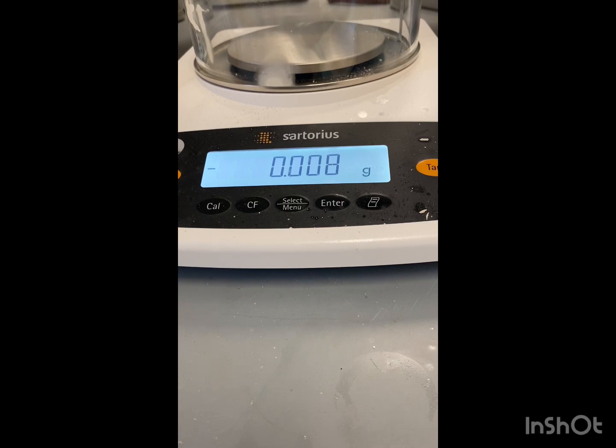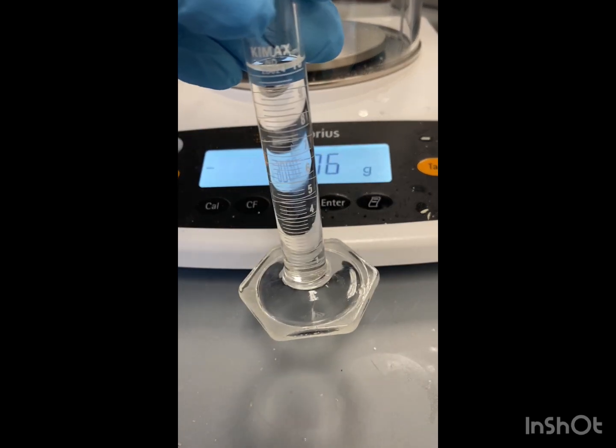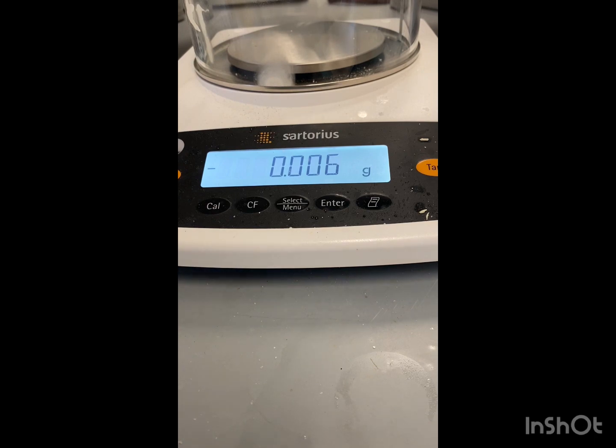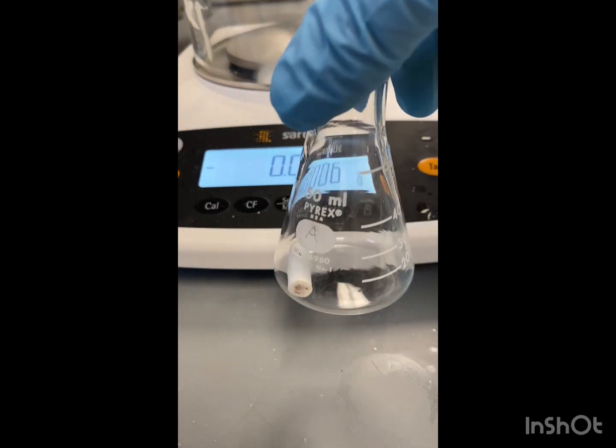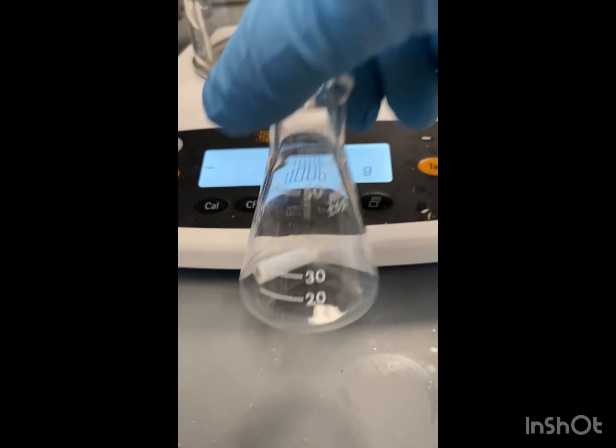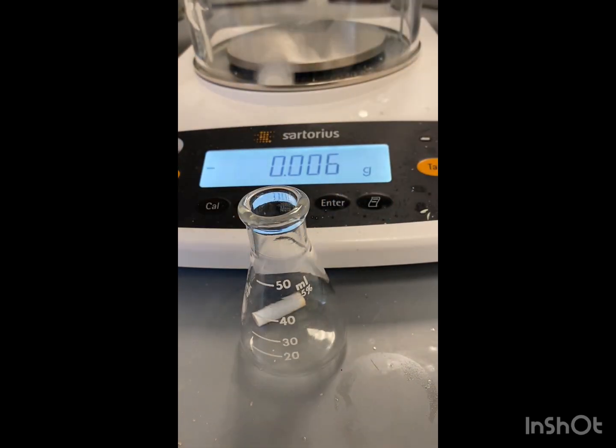All right, so we have our gloves and goggles on. First we're going to get 10 mils of ethanol, which is our solvent. So here's our 10 mils of ethanol and we're going to add it to our Erlenmeyer flask with our magnetic stir bar.